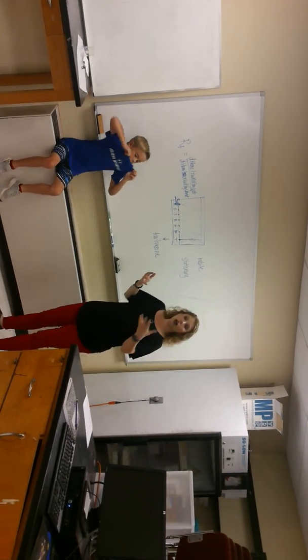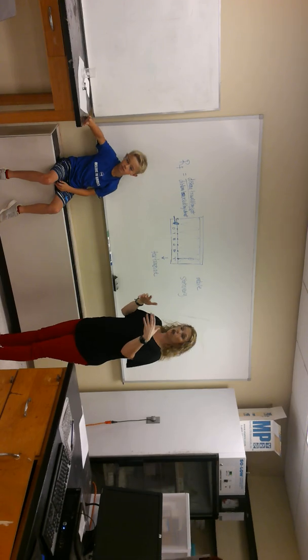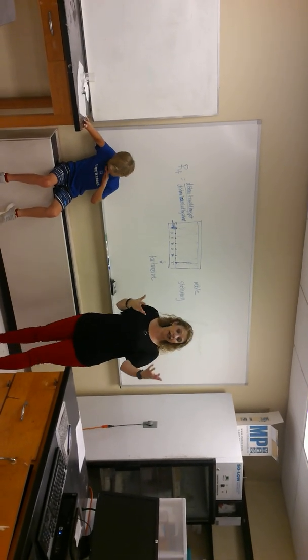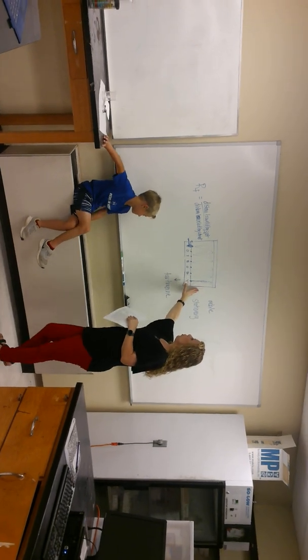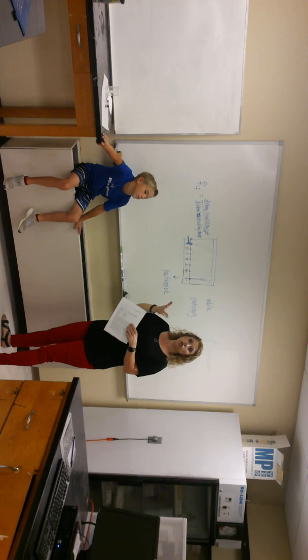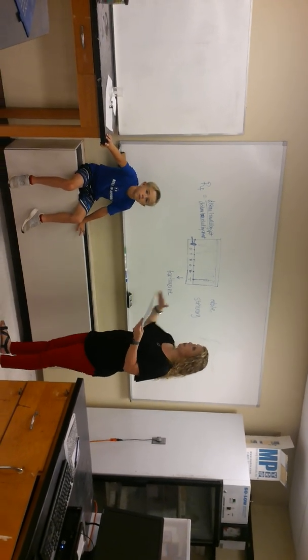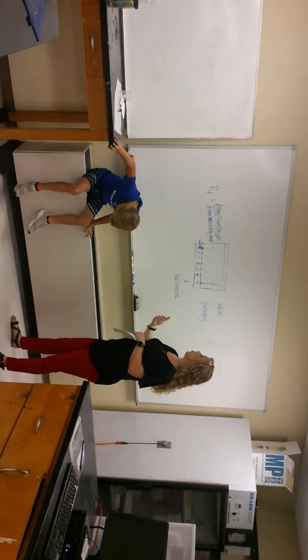When you're waiting on it, we don't want the solvent to evaporate, so we put parafilm over the top of it, and we'll show you how to use the parafilm when you get into the lab. Once you pull this out, you've got the solvent about there. You're going to let it dry. You can do that with a hair dryer or under the heat lamp, and then you can calculate your RF factors, and then you can answer those questions.